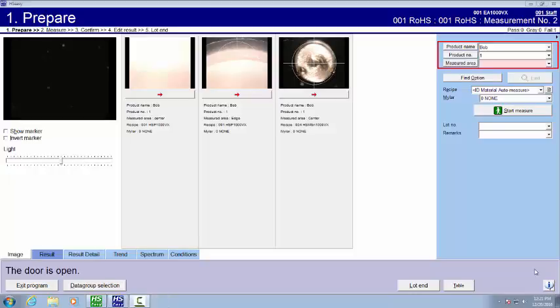I'm working on the Hitachi EA 1000 VX system today. It uses a vortex silicon drift detector. I'm going to work with some ROHS examples.